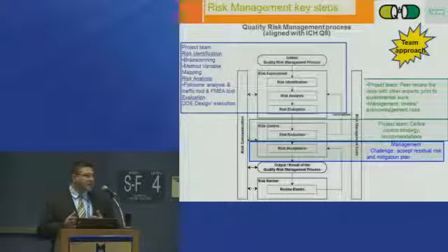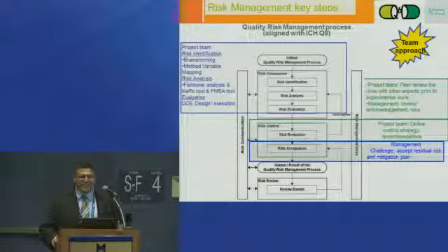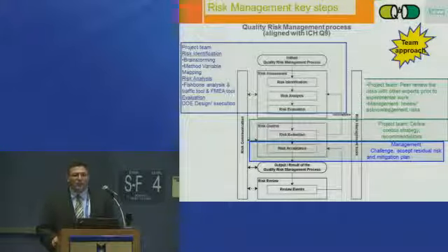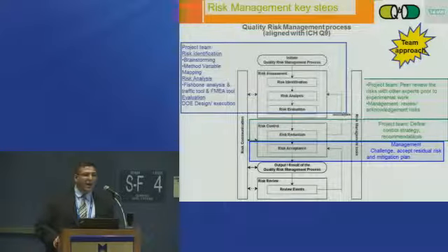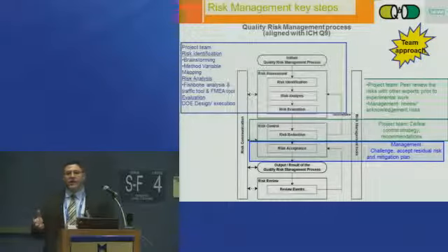So basically here you want to do the right amount of work at the right time. It's not design on everything, okay? It's design of experiments. Sometimes when statisticians get involved, they get very excited and you're generating a lot of data, a lot of experiments, but is it really value added? You have to truly define and do your homework up front as a team to ensure what variables might truly be critical and what impact they may have on the method attributes.